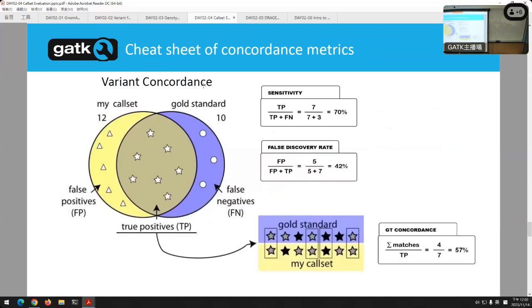Now, speaking of concordance, it's not particularly hard. What concordance does is treat one sample as truth. Let's say you have a source you're treating as truth, the numbers are made up, of course; in any real sample, the numbers are huge. Let's say it's NA12878. You have a certain number of variants you know are in there, and you run NA12878 through your own pipeline as well. And you have a little Venn diagram. You can see where your numbers overlap.